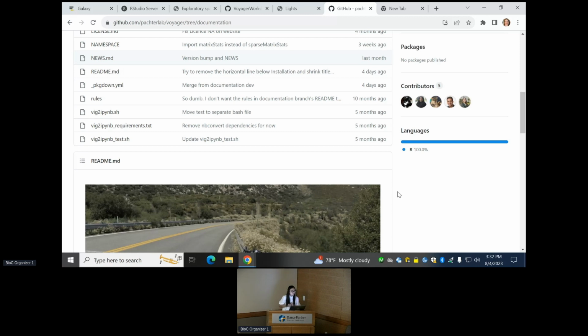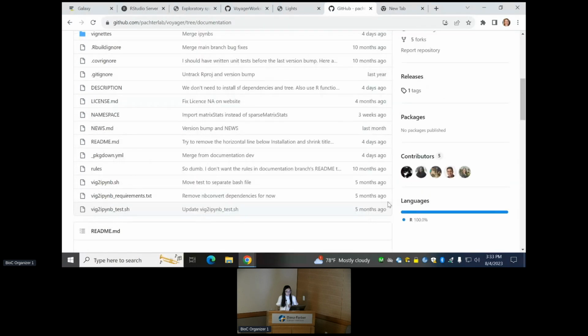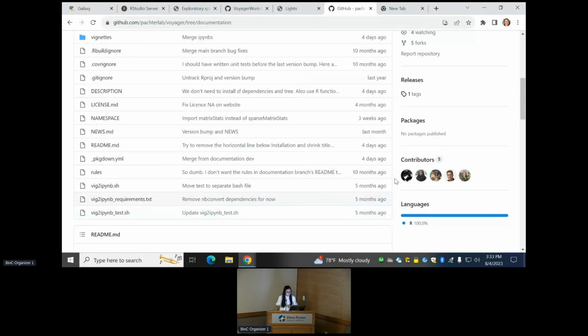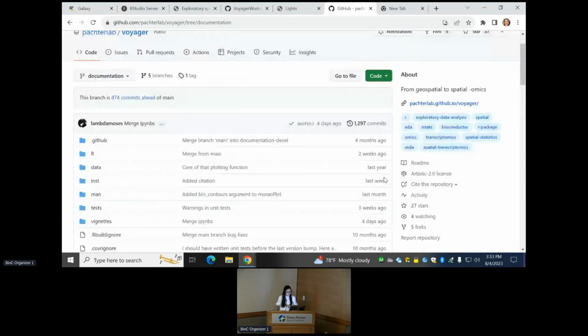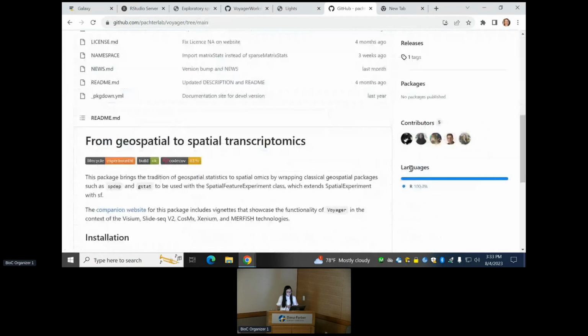Just a clarification: our validation was particularly for pharma and biotech companies looking to identify certain Bioconductor packages to work in the context of validated systems for submission to the FDA and EMA. Every Bioconductor package is unit tested. You've got to pass it, or you start getting spammed by the build system.